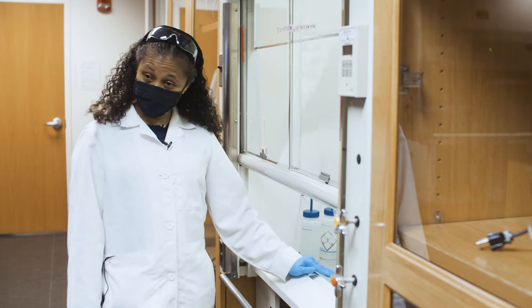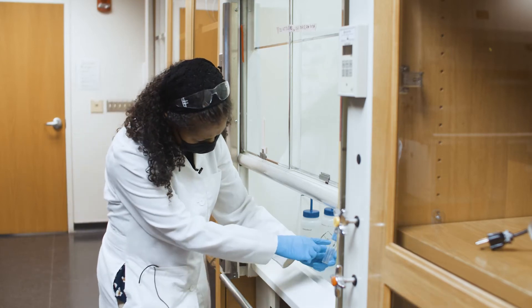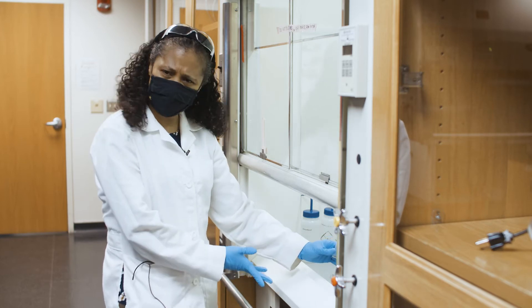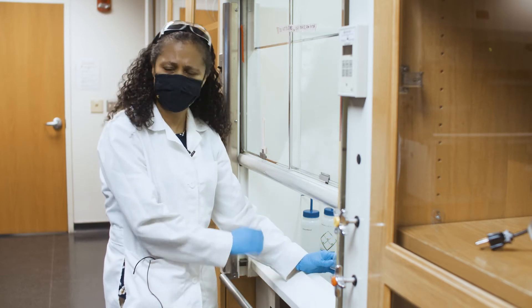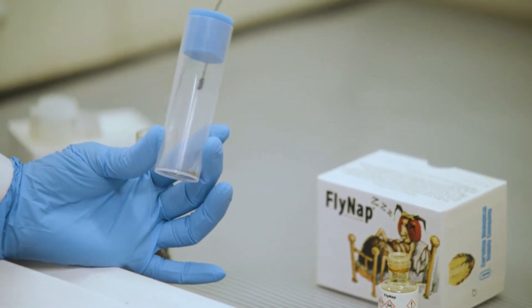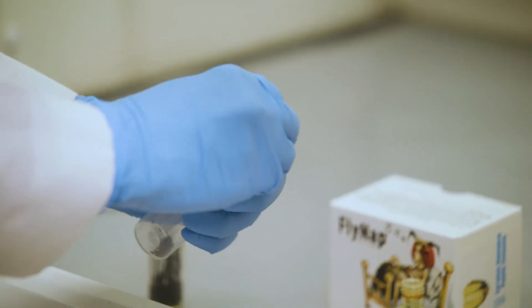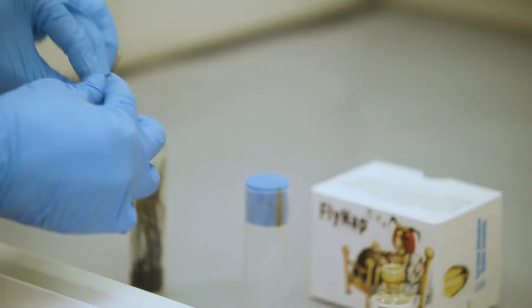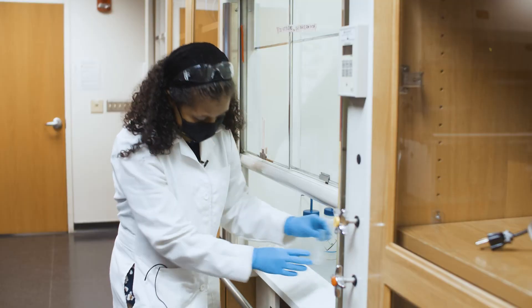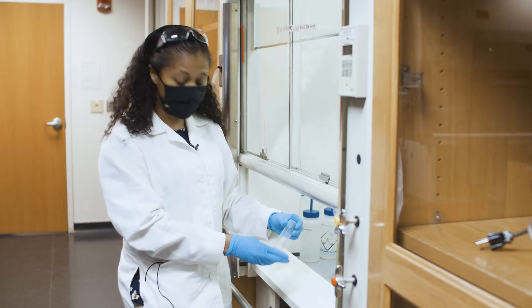The flies have mostly dropped down to the bottom of the vial. There are some stragglers still at the top — sometimes they get stuck even though they're knocked out. You can just give them a little tap to knock them down. Give it one last double check to make sure they're not moving and then remove the wand.